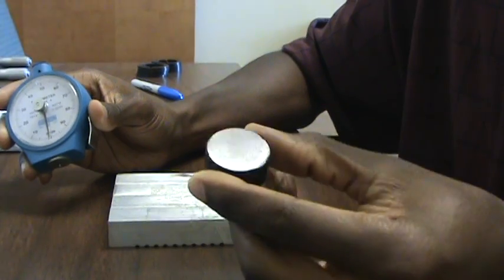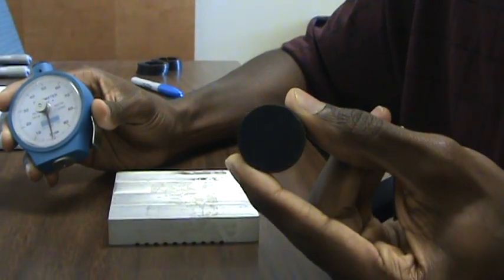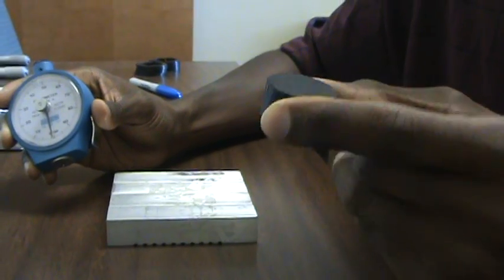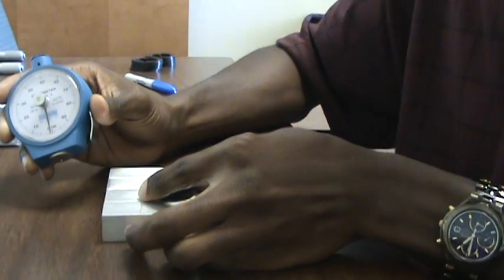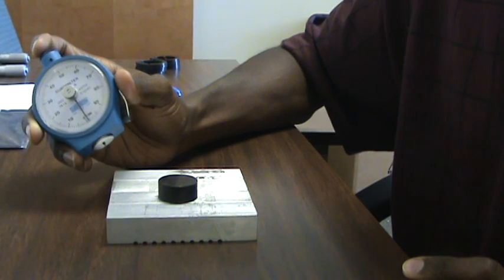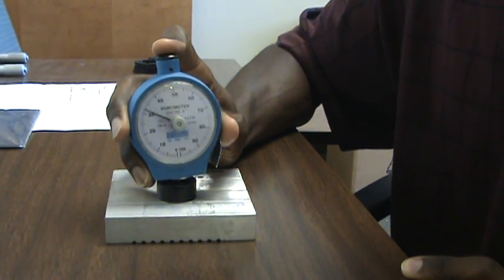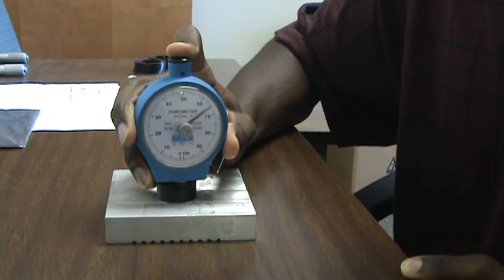A test button is the compound, or a sample of the compound, which is a one-inch diameter by half-inch thick. Place the button on a solid, sturdy surface and press the durometer at a steady rate against the button.